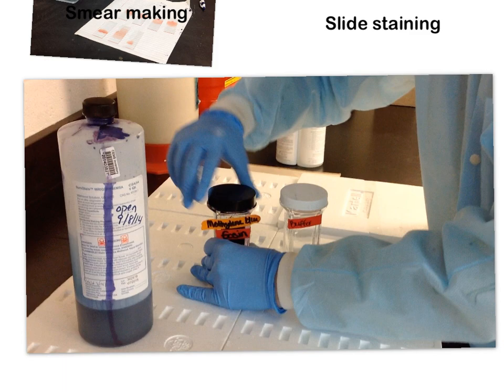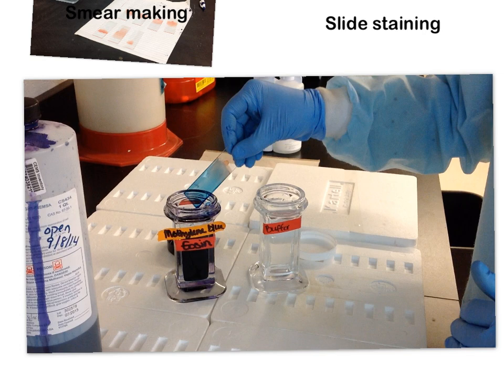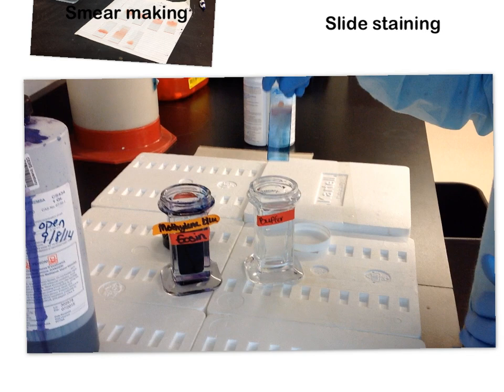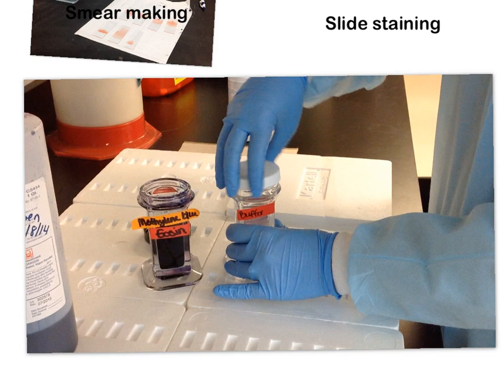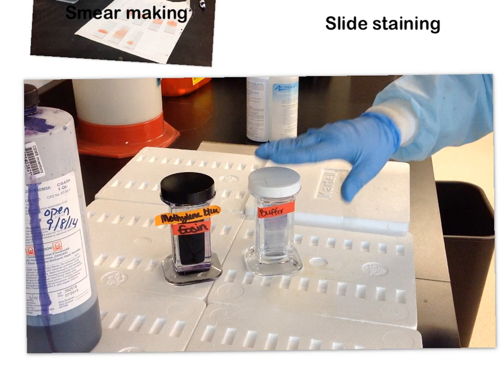After two minutes, take your slide out from the troughs — you can see it's nice and blue. Run it gently along the edge to remove a little extra stain, then go right into the troughs in your buffer. Put the cap on the buffer jar, recap your stain — super important — and let it sit for five minutes.